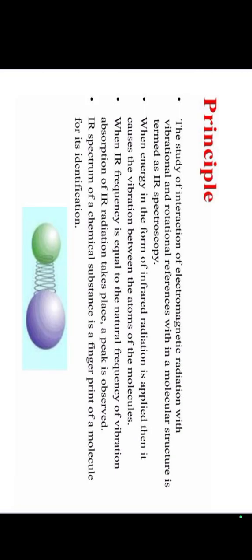Next we see the principle. The principle is based on the absorption type or molecular vibration spectroscopy. IR spectroscopy is an important analytical technique used for determining functional groups in compounds. The study of interaction of electromagnetic radiation with vibrational and rotational levels within a molecular structure is termed IR spectroscopy.